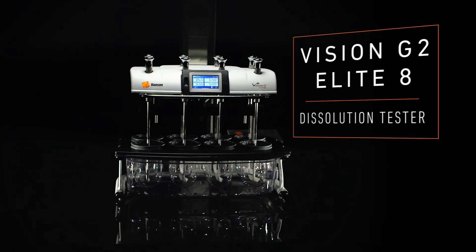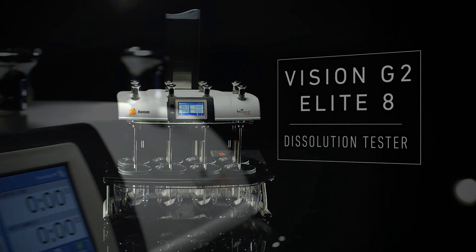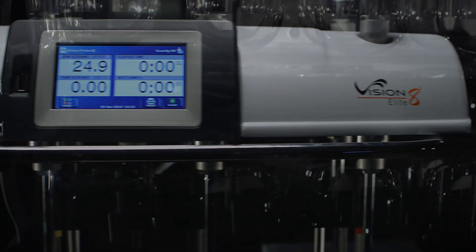The Vision G2 Elite 8, Hanson's newest dissolution tester. A versatile performance machine built for automation and extended applications, the Vision G2 Elite 8 is ideal for dissolution laboratories with a tight schedule as well as dynamic R&D labs.